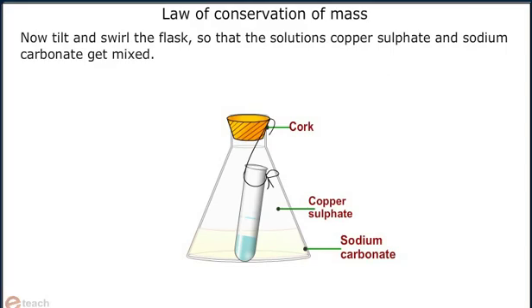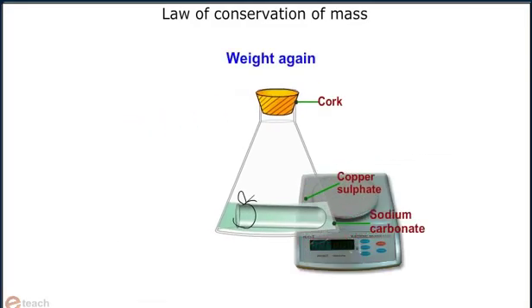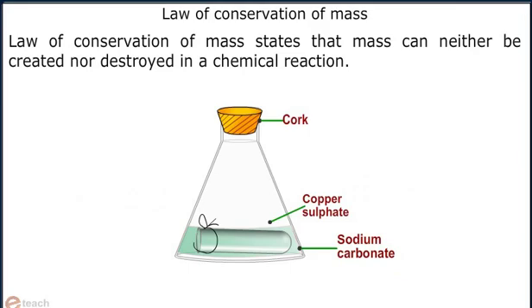Now tilt and swirl the flask so that the solutions of copper sulfate and sodium carbonate get mixed. Let's weigh the arrangement. The weight of the arrangement is 450 gram, even though a reaction is taking place.